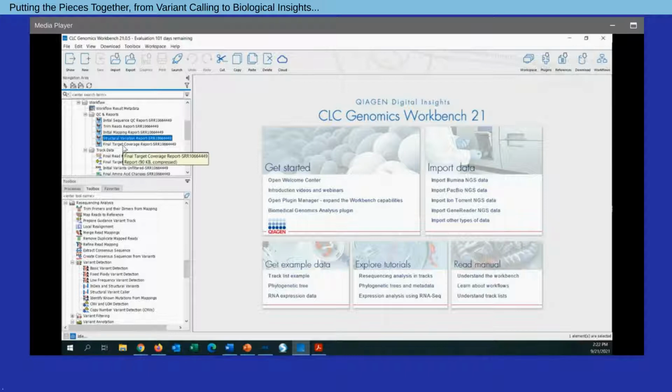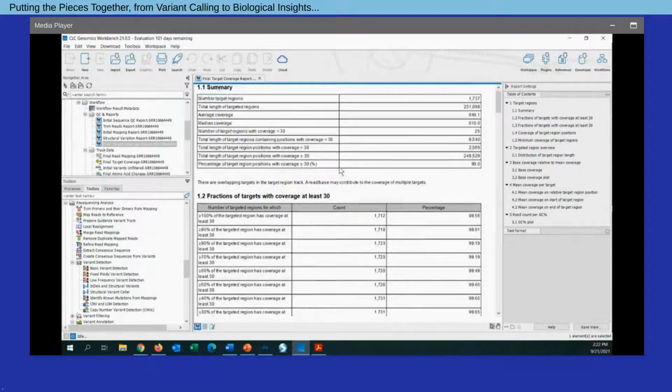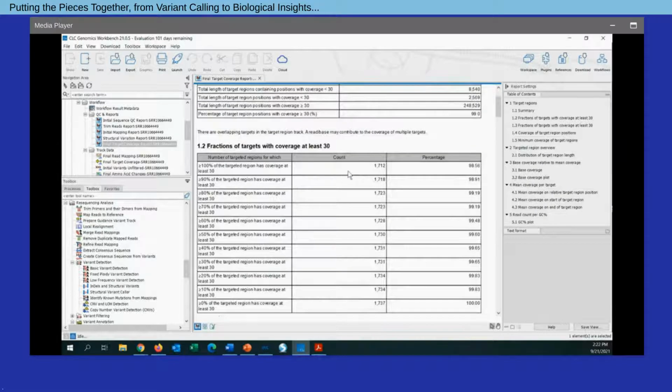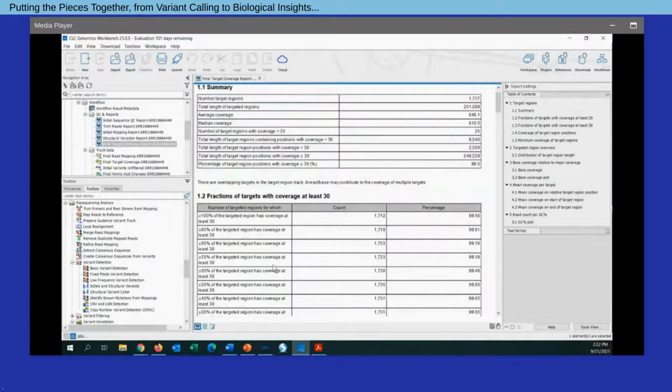But what I want to highlight very quickly is just a coverage report. Again, when we're doing variant detection, understanding coverage within our samples is very important. And when I open this report, what I'll see very nicely is that, in fact, we have high overall coverage, over 600 reads per sample. The median coverage is very similar. And when we look at the percent of targeted regions that have a certain threshold of coverage, just about all of our regions here have a coverage of 30 or greater, and on average, 600 reads per locus. So this gives us some context to know that we have appropriate sequencing depth to hopefully get a good sense of the variants within our sample.